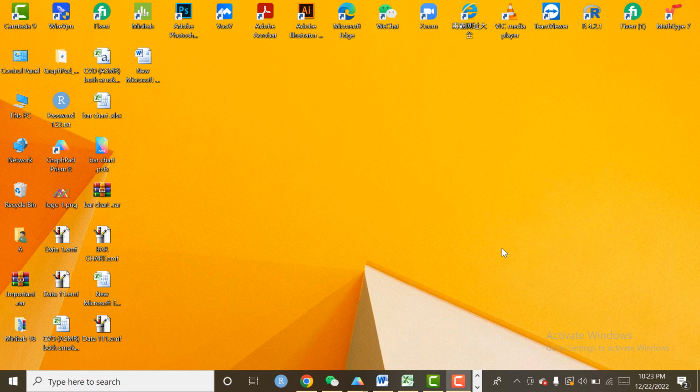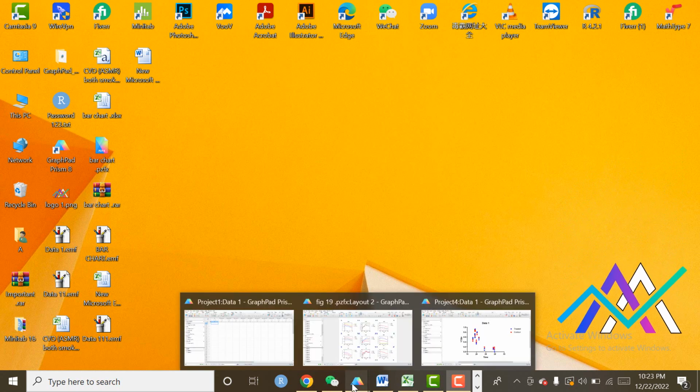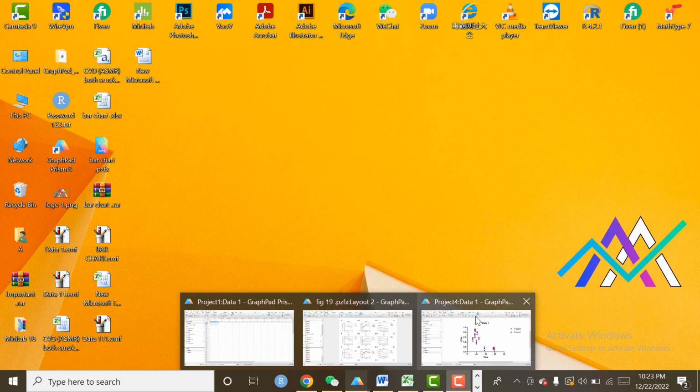In this video tutorial I am going to show you how to use GraphPad to create an XY scatter plot. So let's start. First of all I will open GraphPad.